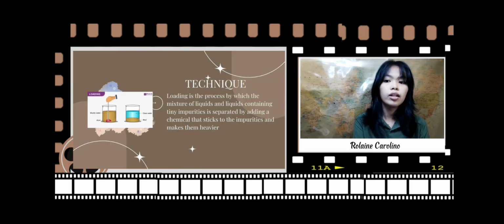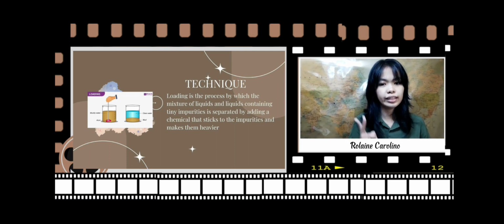Decantation technique. Loading is the process by which a mixture of liquid containing tiny impurities is separated by adding a chemical that sticks to the impurities and makes them heavier. This procedure can also be used to separate two liquids that do not mix with each other, for example, oil and water. The oil-water mixture forms two distinct layers with water at the bottom and oil at the top.